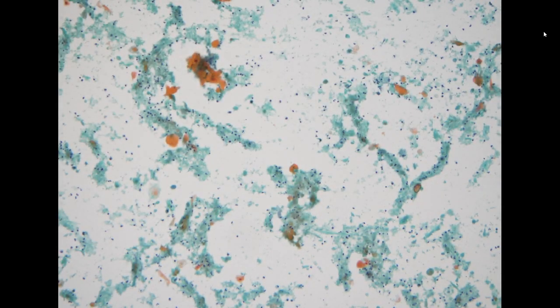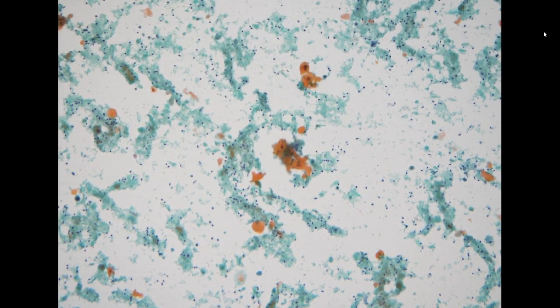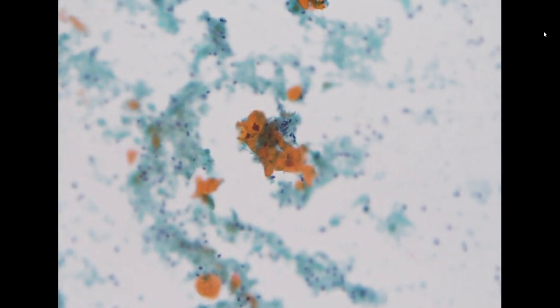The next specimen is also not very common to see. Probably we will see one or two every year. So this is a pericardial effusion, not pleural effusion, pericardial effusion. The patient had a past history of esophagus squamous cell carcinoma. So squamous cell carcinoma rarely will go to body cavity and show body fluid accumulation. But in this case, it is definitely positive for squamous cell carcinoma.